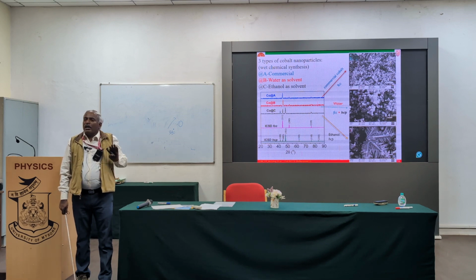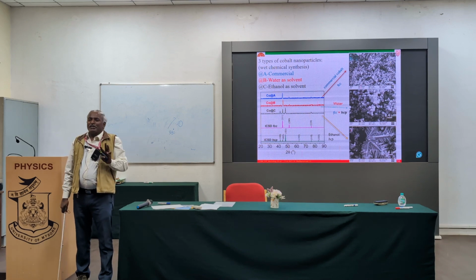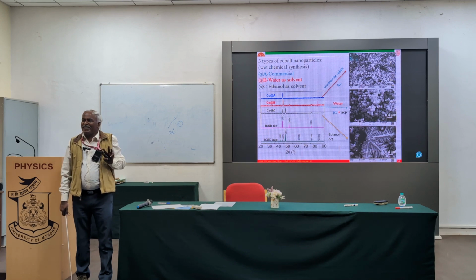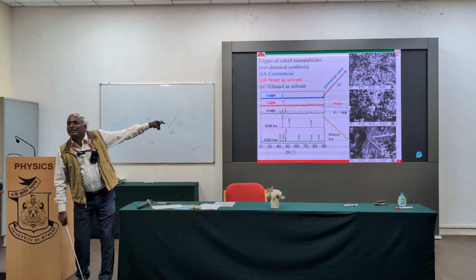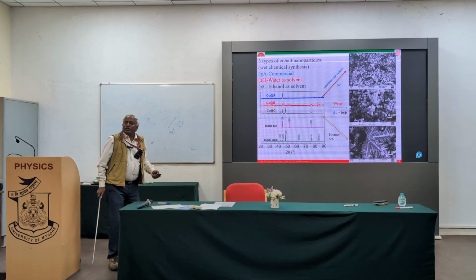That is halfway Rama, halfway Krishna, because both Rama and Krishna have 3 characteristic properties: both of them become angry, both of them are friendly, and only one parameter is different. If I want to quantify how much of Rama and how much of Krishna, it is hard. In the same way, here it is hard to identify which phase has formed correctly. Hence, we go with the IFNMR technique.